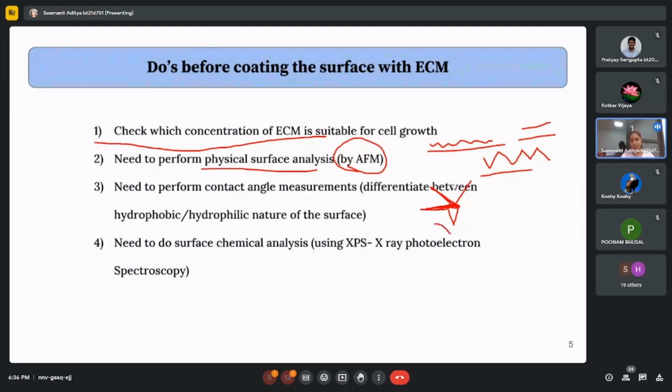So basically, if the surface is like this, then your cantilever can detect the surface by the needle region of the cantilever, and it can detect how deep or how elevated the surface is. If it is deep, then the cantilever will go down, and as the cantilever goes down, the light that is shined on the cantilever will be reflected at a different angle. Once it is going up, the light will be shining at a different angle.